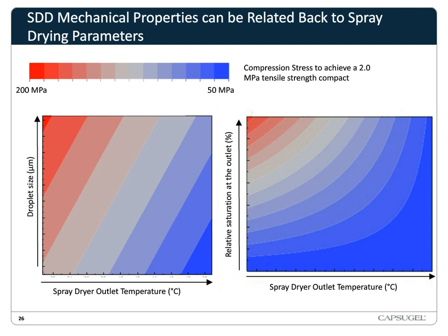When we start making these models, we can really optimize this mathematically, not only maximizing the mechanical properties and flow properties, but we can also check things like the derivative to understand if we're in a very robust space or not.